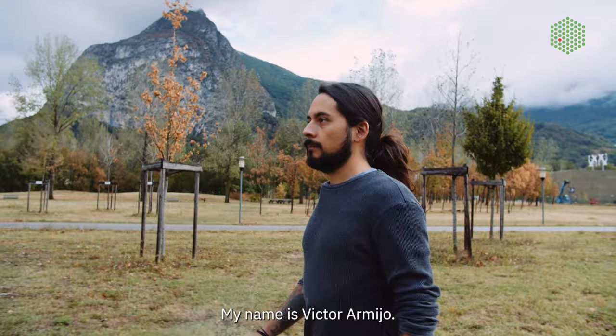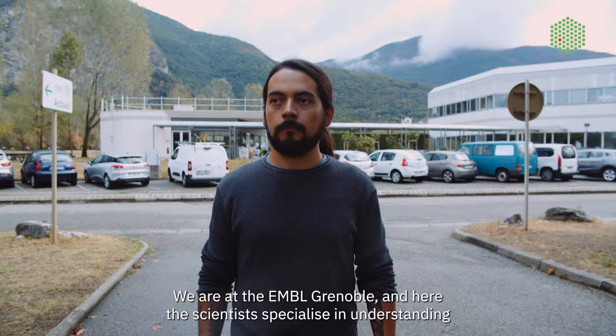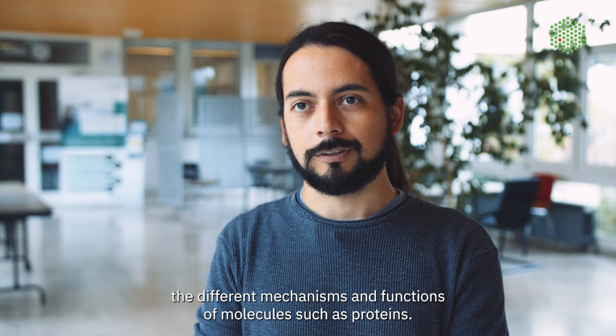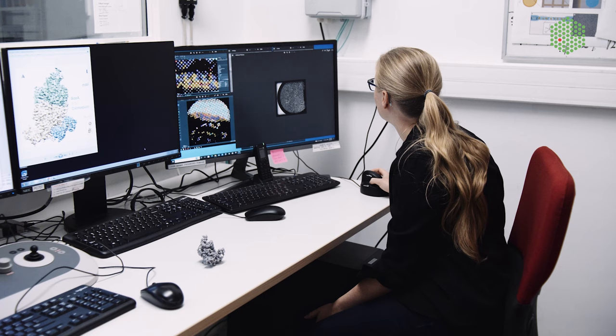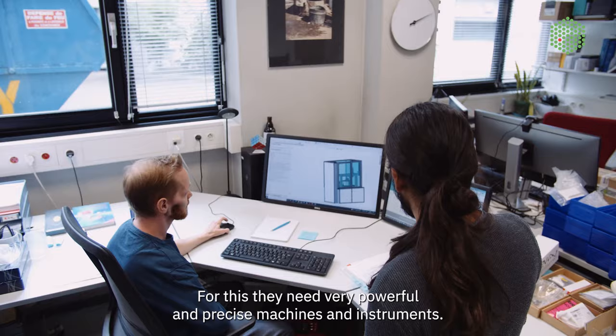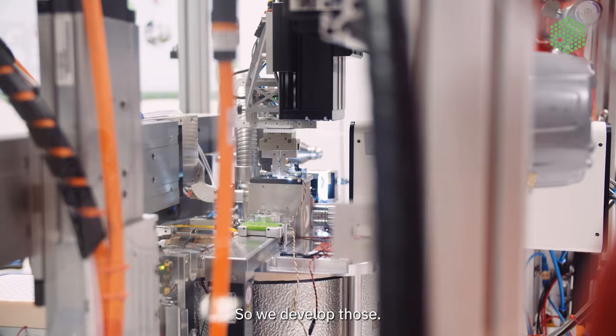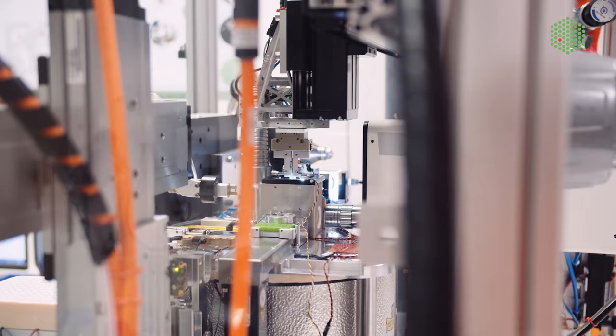My name is Victor Armijo. I'm a Mexican mechatronics engineer. We are at the EMBL Grenoble, and here the scientists specialize in understanding the different mechanisms and functions of molecules such as proteins. The end goal for them is to determine the structure of the molecules at an atomic level. So for this, they need very powerful and precise machines and instruments. So we developed those.